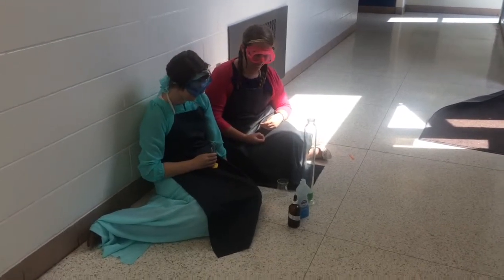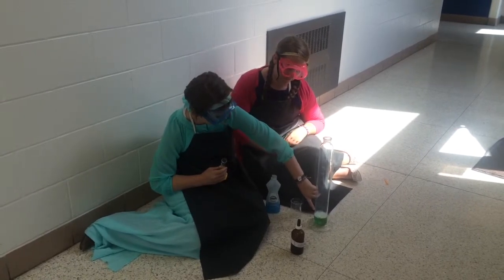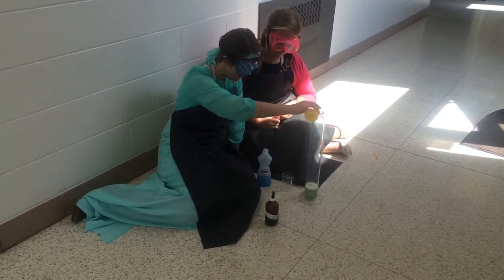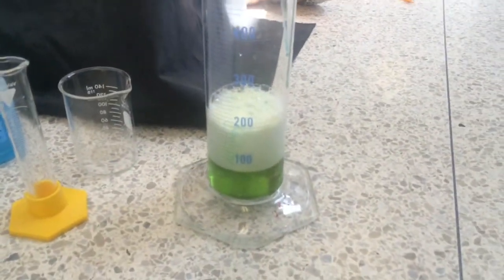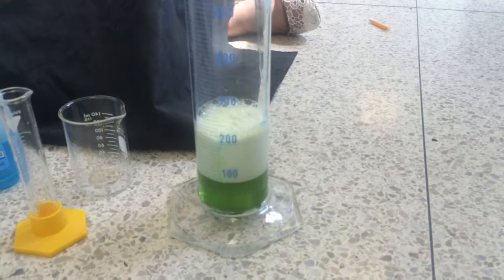Alright, so it just turned green, so we're going to add some foam. Yeah, so if you can see, there is a small amount of foam growing in our solution, so we're going to add some more. So as you can see, it's growing. So the potassium iodide is mixing with the hydrogen peroxide to create an exothermic reaction and a decomposition reaction, which causes the foam to grow.